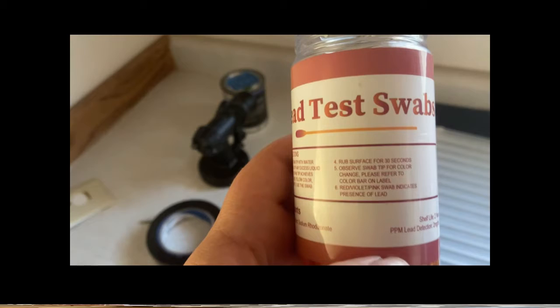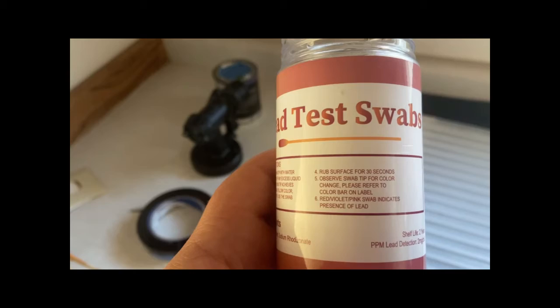It does say rub for 30 seconds, then observe the swab tip for color changes. A red or pink swab indicates the presence of lead.